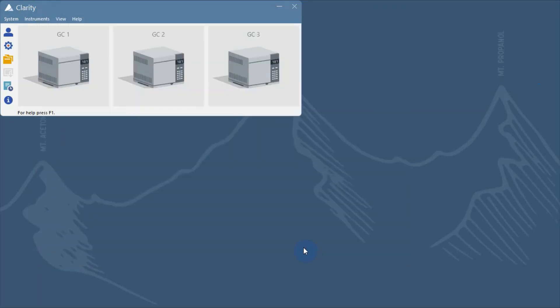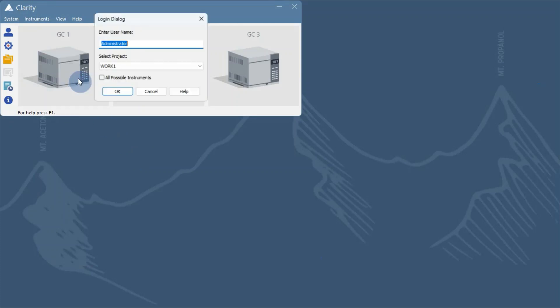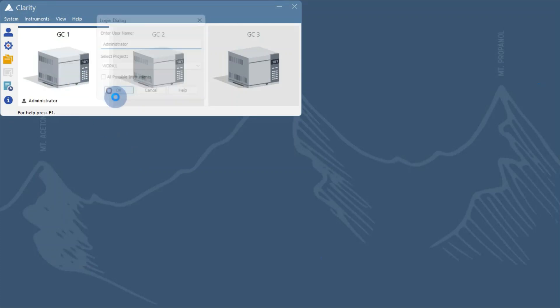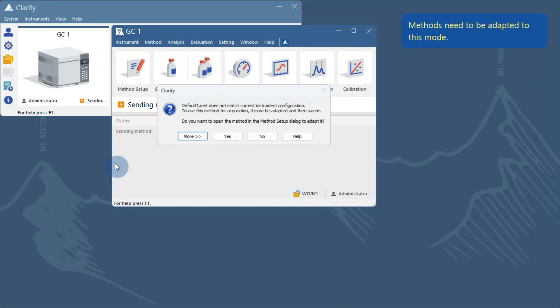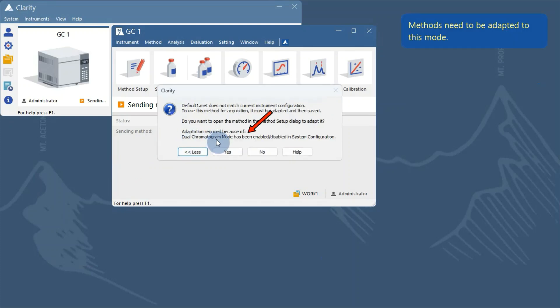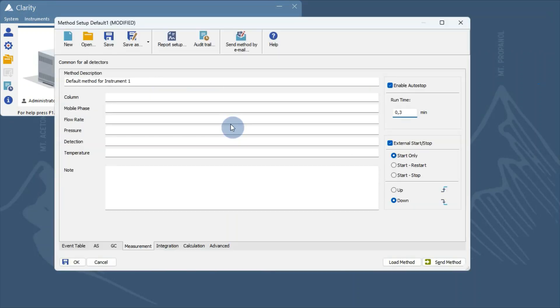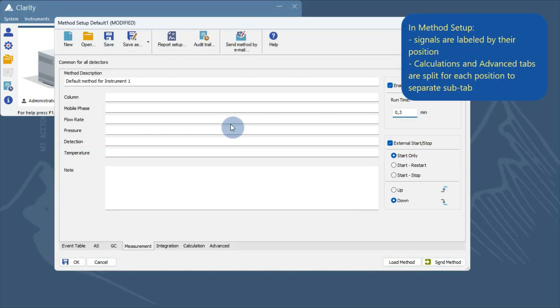Now, let's login to the instrument. Methods need to be adapted to the Dual Chromatogram mode. Detector signals are labeled by their position, and which signal is saved can be further adjusted in the method.